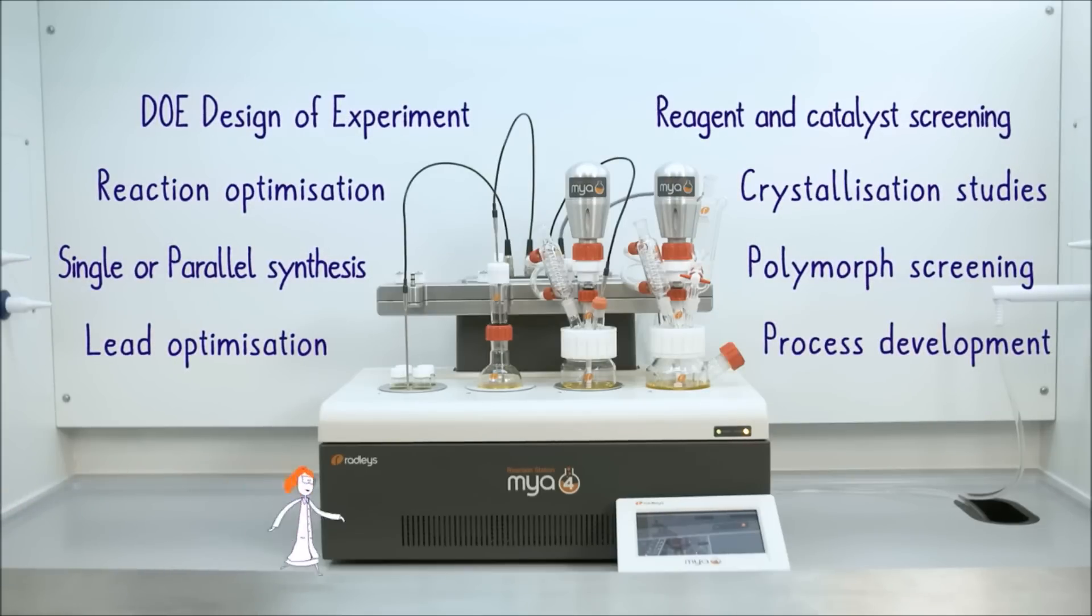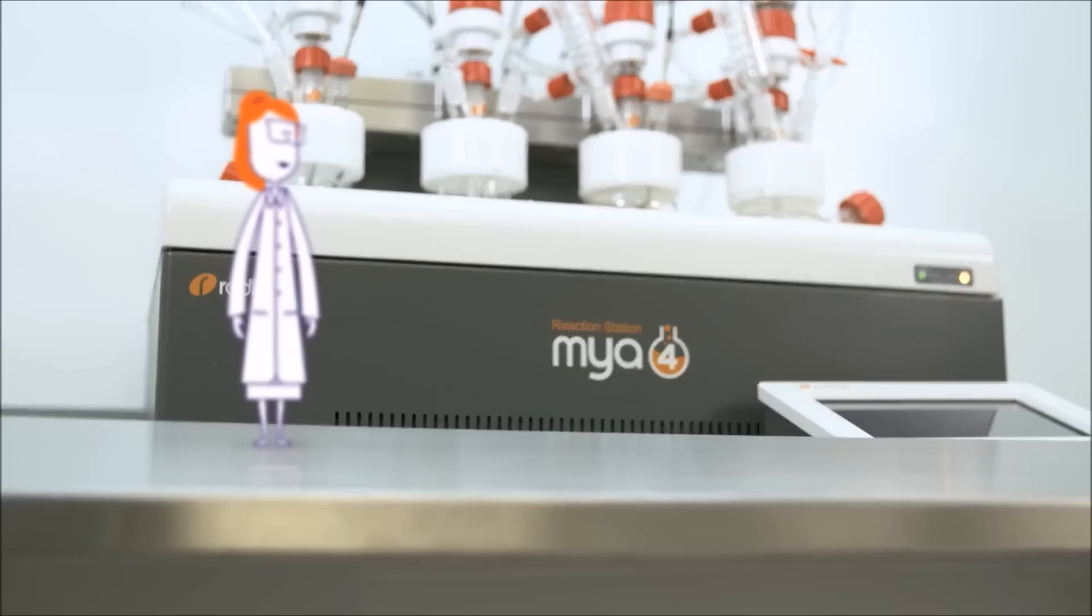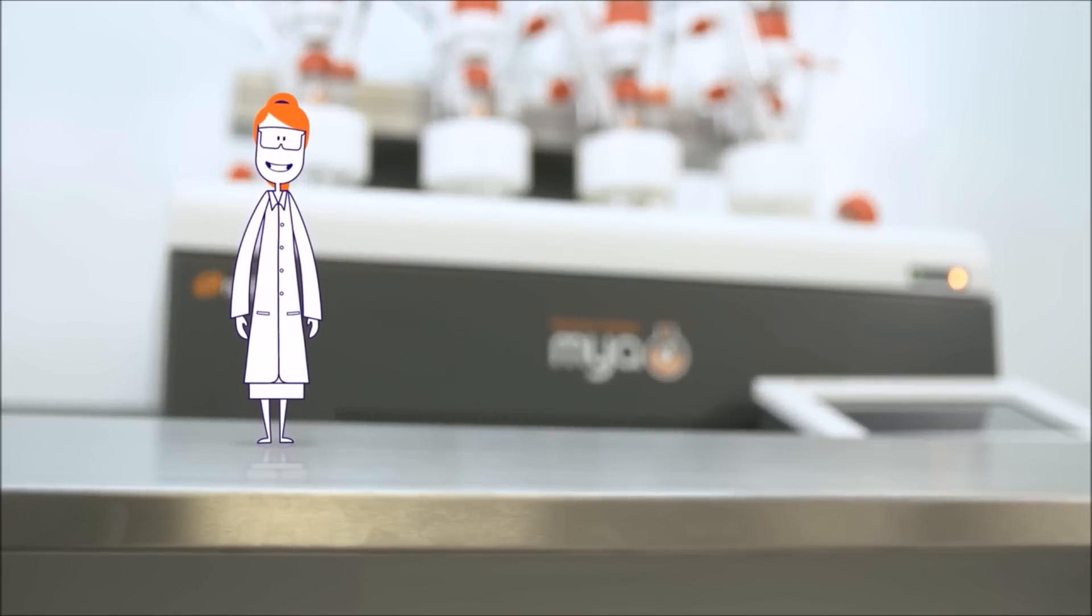Maia 4. One reaction station with limitless possibilities. The future of chemistry today.